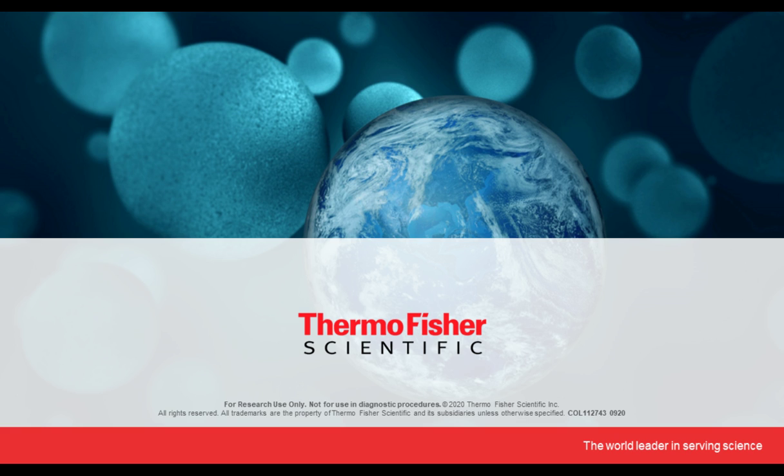Thank you. Okay, your next question, how can you use it within an actual Western blot experiment? Yeah, so I think I talked about it a couple of times, but just to briefly go over it again. What you would do is after your transfer is done, no matter what your actual experiment is, after you finish your transfer, you would take that membrane and probe it with No-Stain labeling reagent.